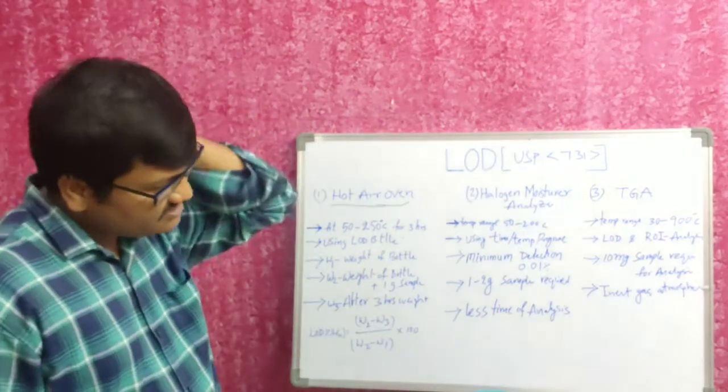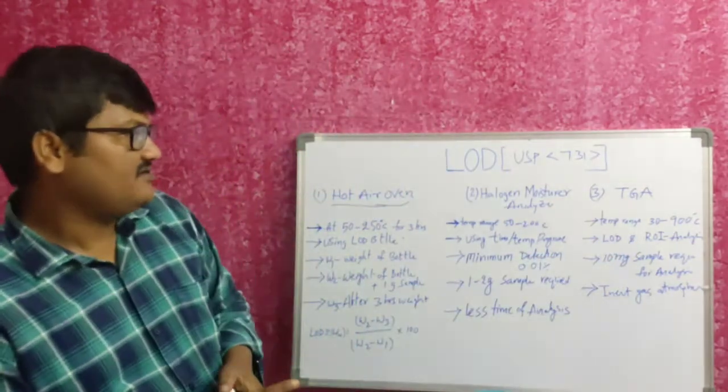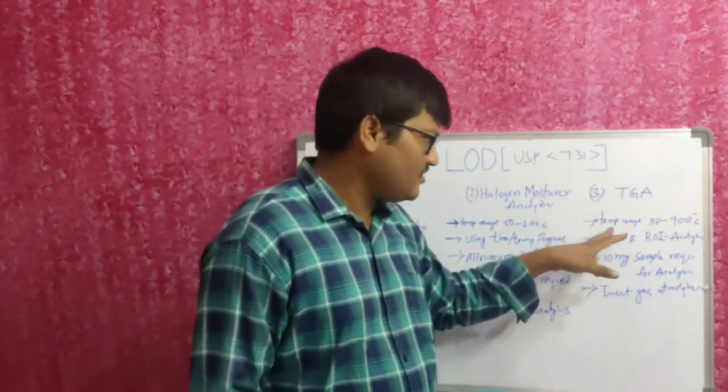And the next one is TGA, thermogravimetric analysis. It is a very advanced technique.